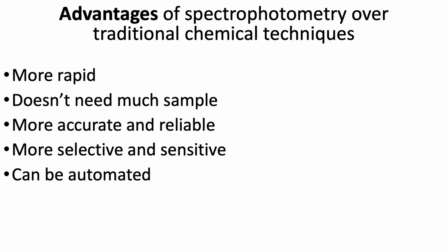A wide array of these spectroscopic techniques are applied in virtually every kind of scientific research. Not just analytical chemistry, which is just measuring normally how much of different things there are. So you'll find it in environmental analysis, right? Environmental chemists will look at it. Biomedical science uses it all the time. Forensics, police kind of work, where they use it. Material science, even space exploration.